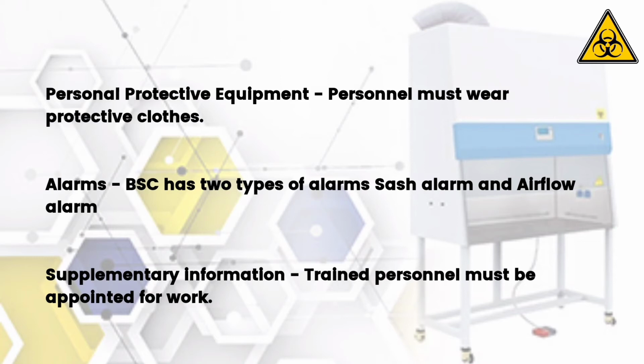Supplementary information. The person who supervises the equipment should be properly trained with enough information about the Biological Safety Cabinet. Selection of the cabinet, installation, annual certification is complex process. Therefore, highly qualified professional must be needed for this supplementary information process.